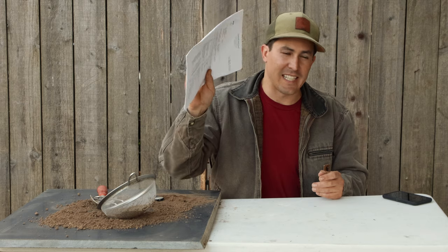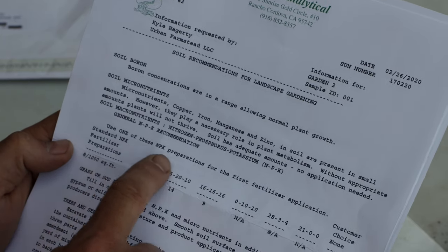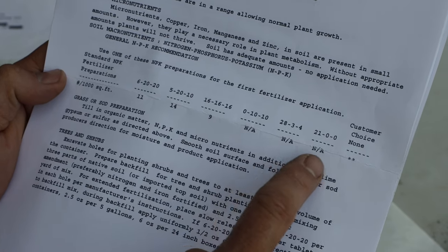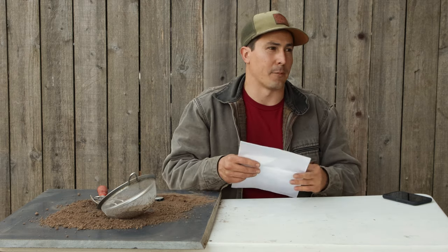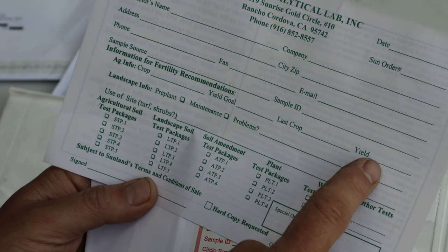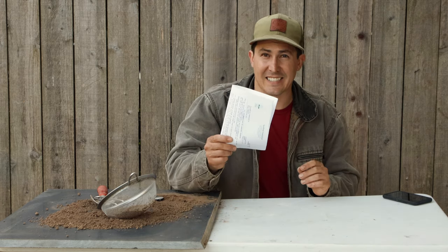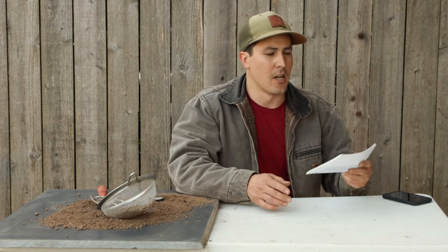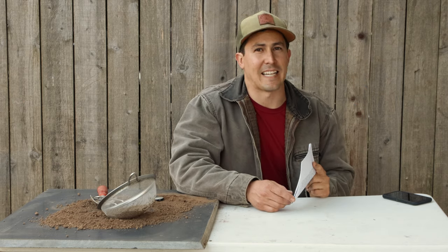Based on this, I have to assume that the soil analysis from the lab is my most accurate test. The LaMott test kit was very, very close to this, so I would say that LaMott test is pretty darn accurate. The Rapid Test Kit was accurate as far as the pH, and it wasn't completely off on the others — it just said my potassium was higher than it actually is and my nitrogen and phosphorus were lower than they actually are. This lab test is really good: it shows accurate numbers for all of those and also shows all my micronutrient levels, and based on what I'm growing, it recommends what I should be adding to my soil per thousand square feet. The only downsides are that it's expensive, it's a one-time test, and it took about a week and a half to get back.